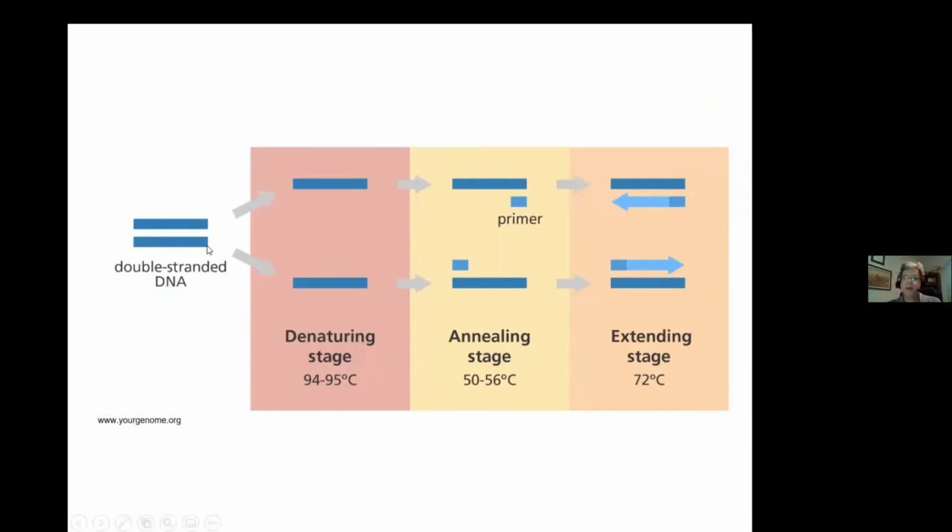That's the chain reaction part. But to get the two strands to come apart, you have to heat it up to like 90 degrees C, which is close to boiling. And there's a problem: DNA is not the only thing in your test tube. You have DNA, but you also have this enzyme, which is a protein, and proteins also denature. If you denature a protein, it comes apart, and then when you cool it back down, it doesn't fold up correctly. It won't work.